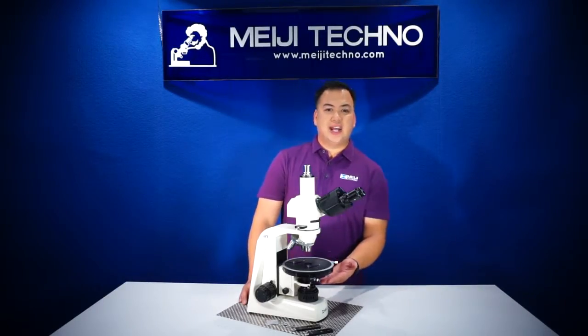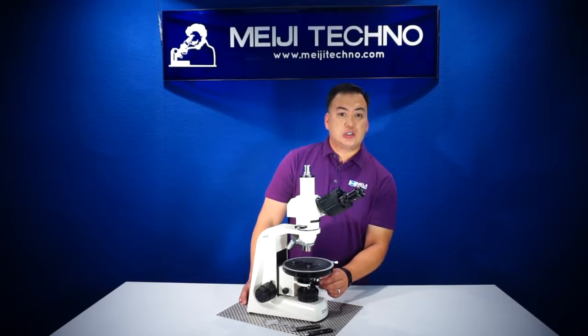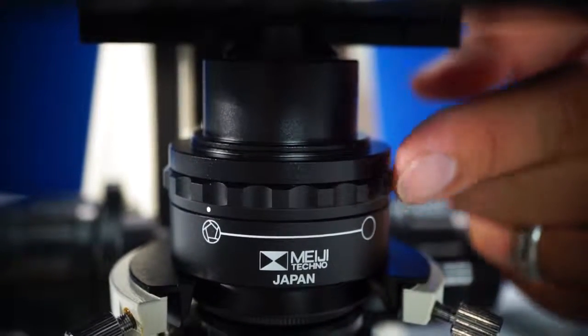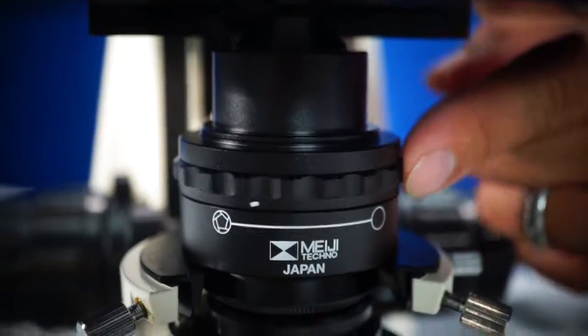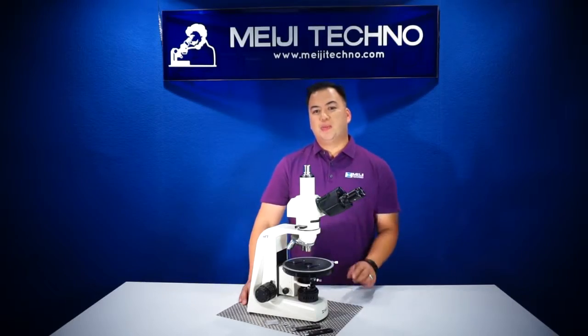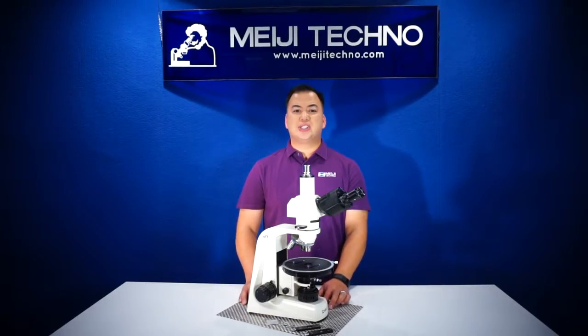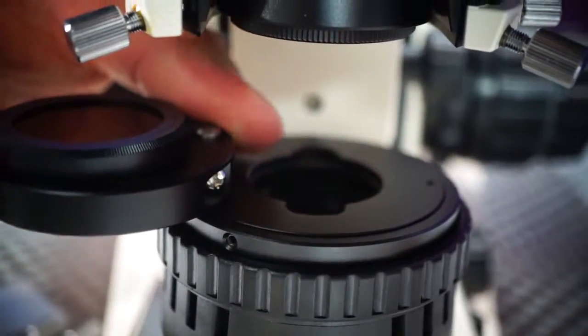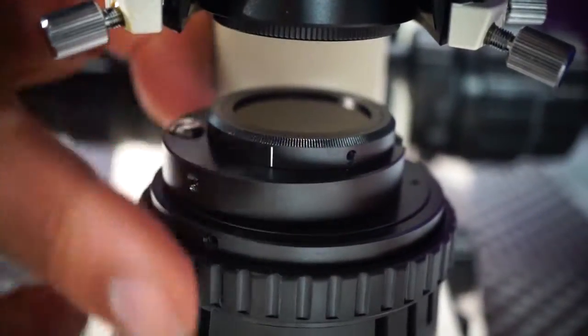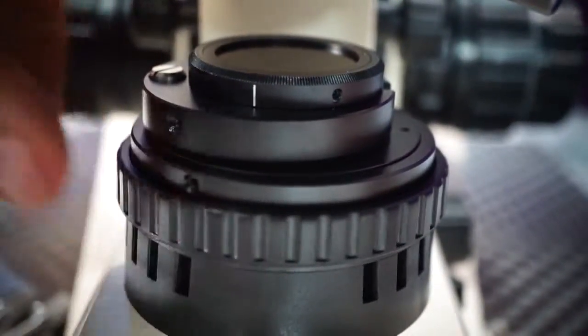Below the stage of the MT-9000 is a centerable strain-free Abbe condenser with a built-in iris diaphragm set up on a dovetail mount. On the bottom of the base, the MT-9000 series comes with a rotatable polarizer, as you can see here, and it also has a detent at 0 to 90 degrees.